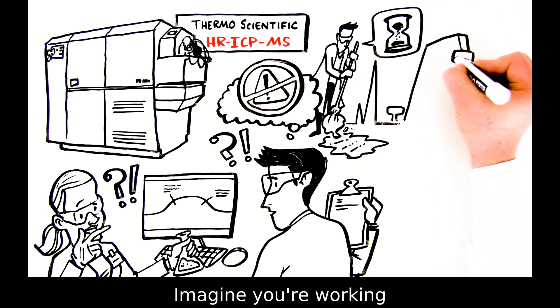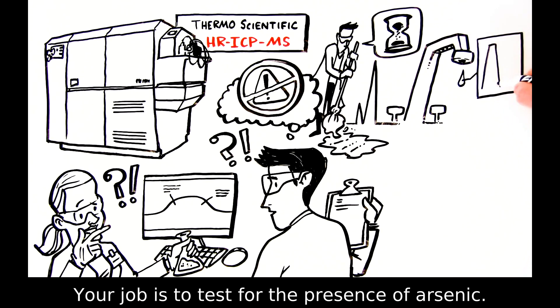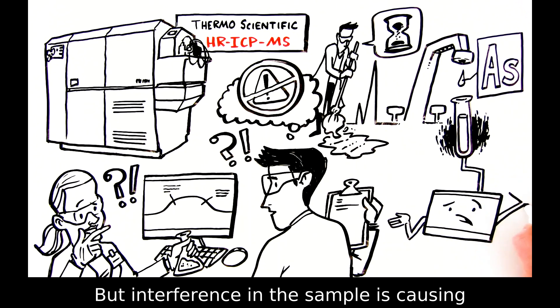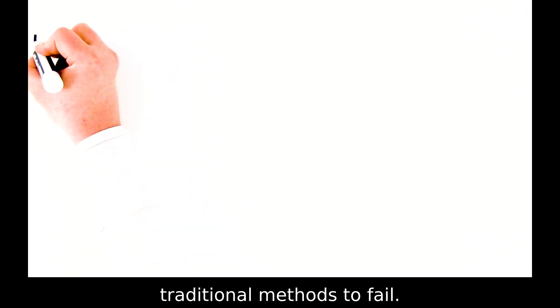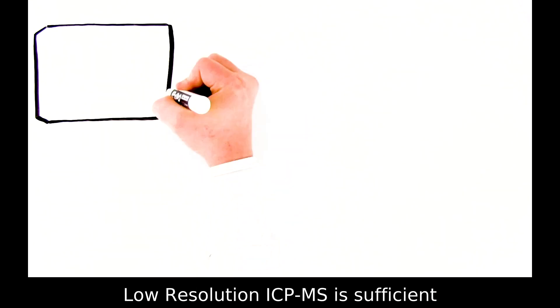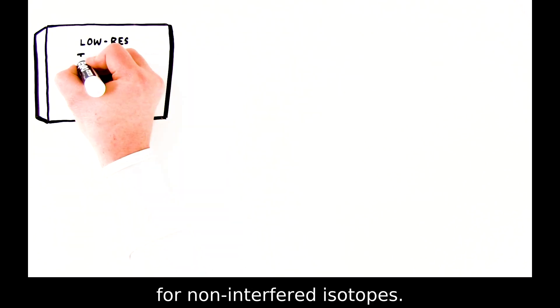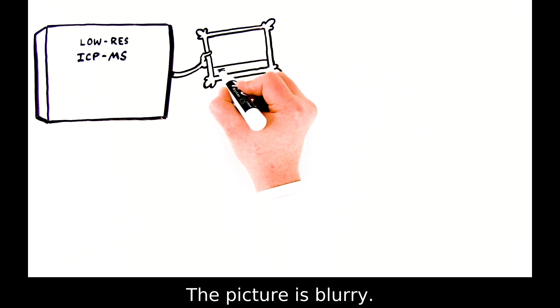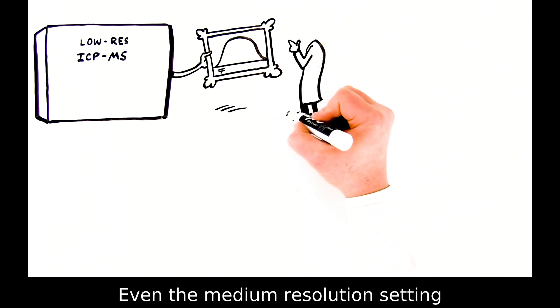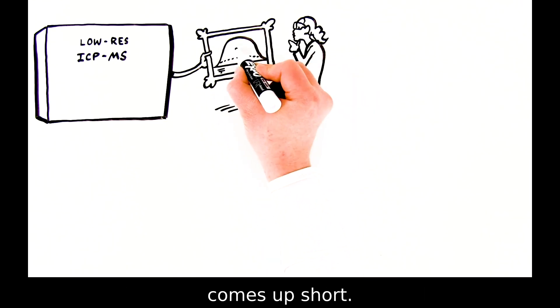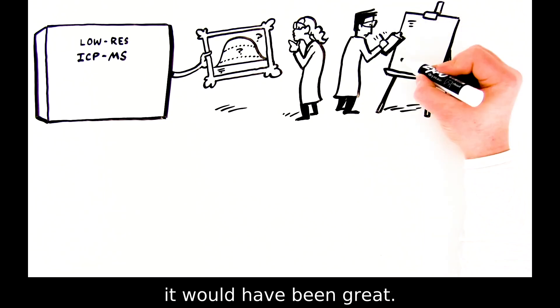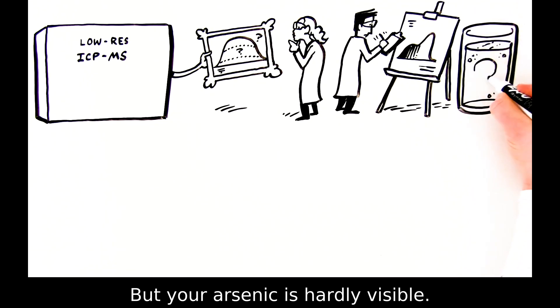Imagine you're working with a sample of drinking water. Your job is to test for the presence of arsenic, but interference in the sample is causing traditional methods to fail. Low-resolution ICP-MS is sufficient for non-interfered isotopes, but it's not selective enough for your arsenic. The picture is blurry. Even the medium-resolution setting comes up short. If your analyte of interest were a transient metal, it would have been great, but your arsenic is hardly visible.